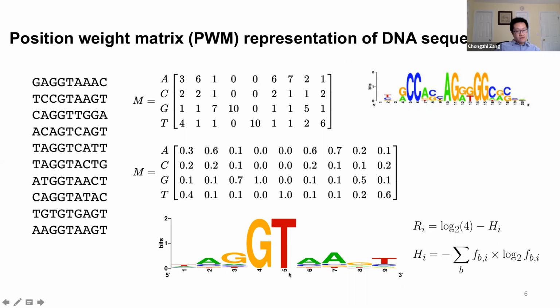And the second layer of information represented in the sequence logo is the information content contained in each position. The information content is defined as this.